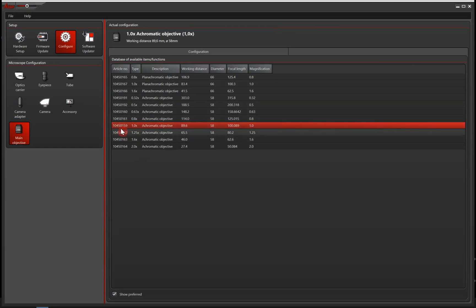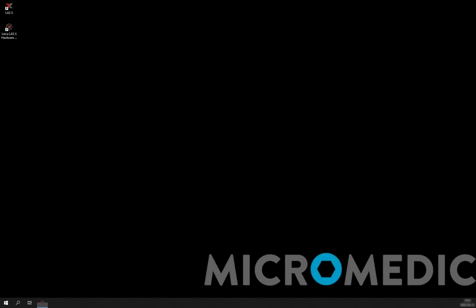Choose that in the list here. And once we have done this, we are done. And we can exit the hardware configurator and we can open up the LASX application and just go ahead with our imaging.